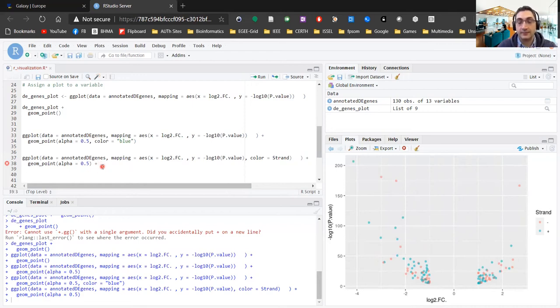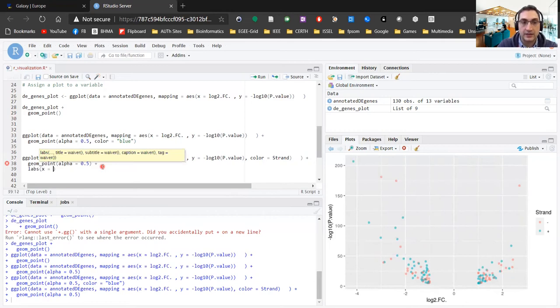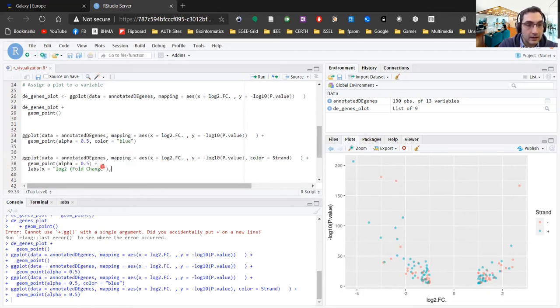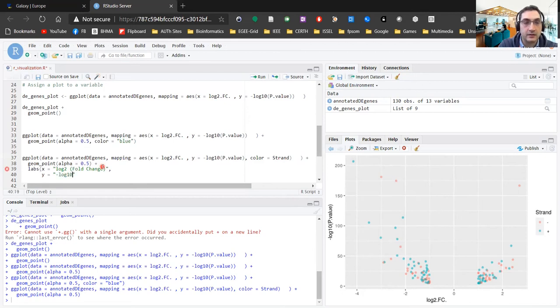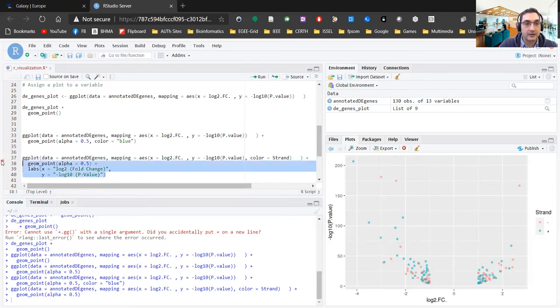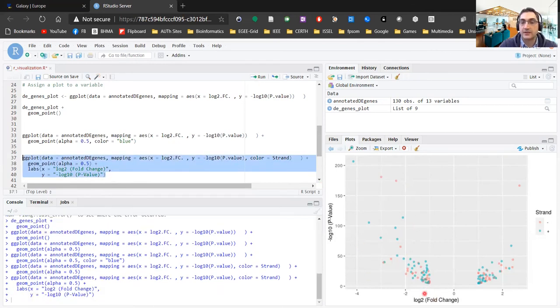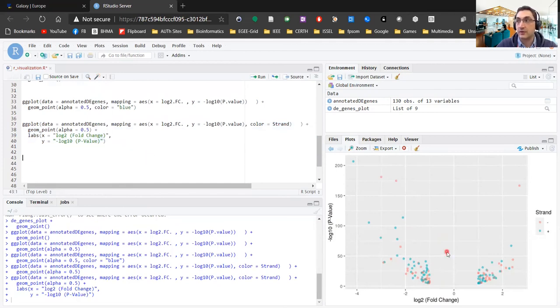We can also improve the axis labels. 'log2fc' is useful but it's just the name of the column. To fix that, I'll add another layer using labs — which stands for labels. I'll set the x label to 'log2 fold change' and the y label to '-log10(p-value)'. Running this gives much more informative axes so you can easily assess what you're looking at. This is a much more elegant plot.